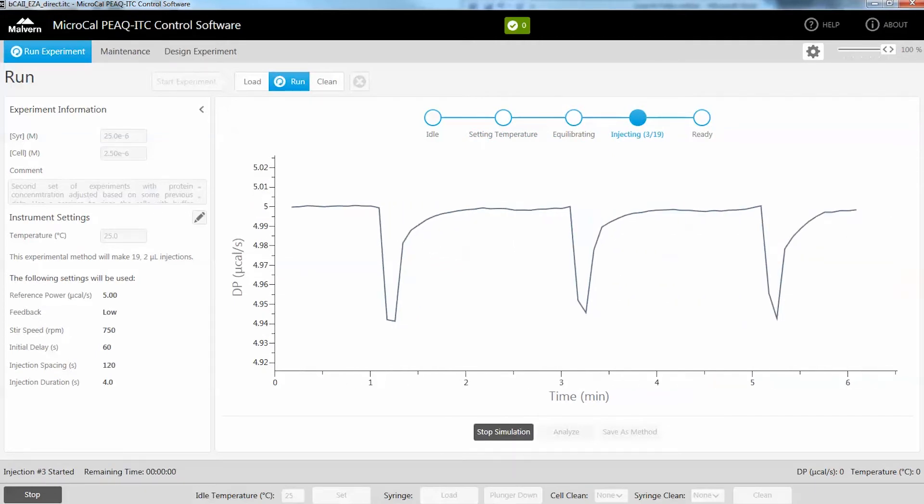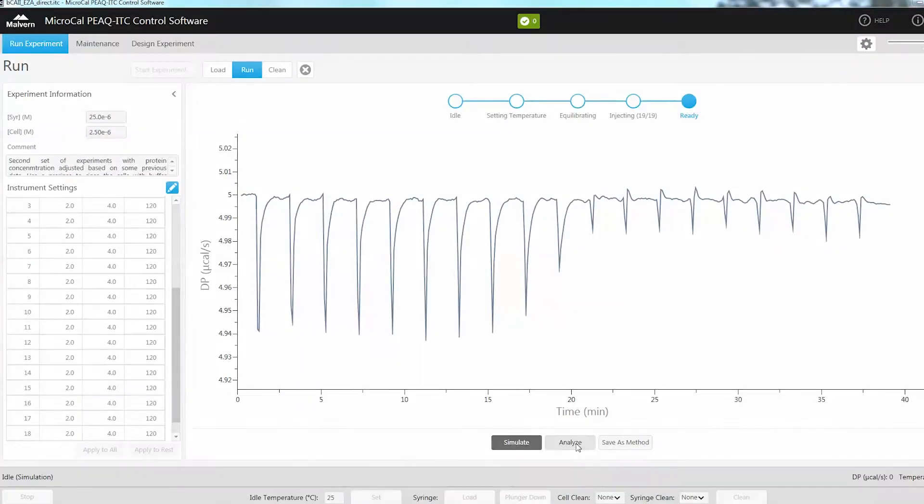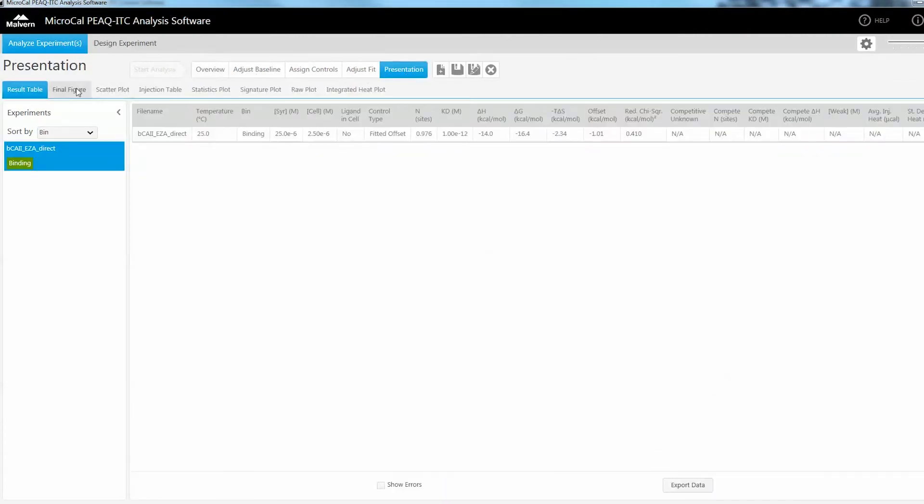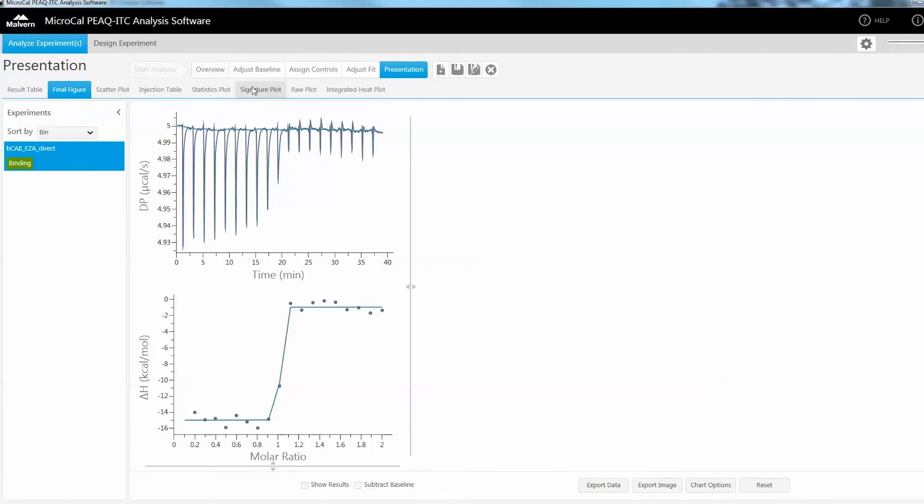At the conclusion of your experimental run, simply click Analyze, and the MicroCal PEAQ ITC analysis software will open and automatically generate fitting results in a range of graphical outputs.